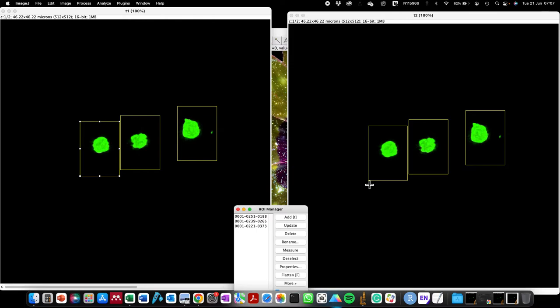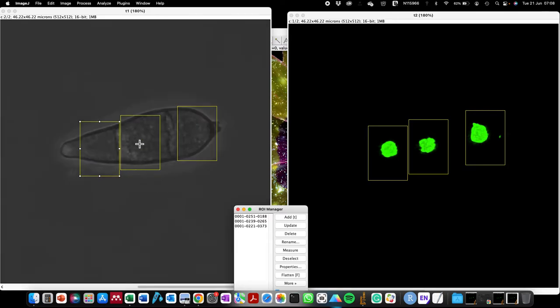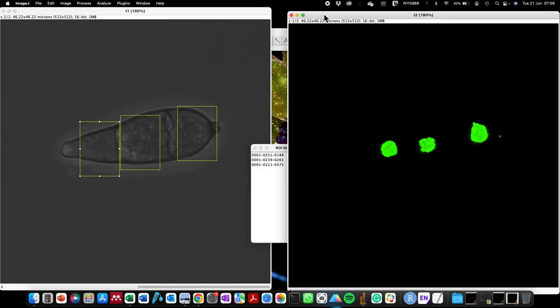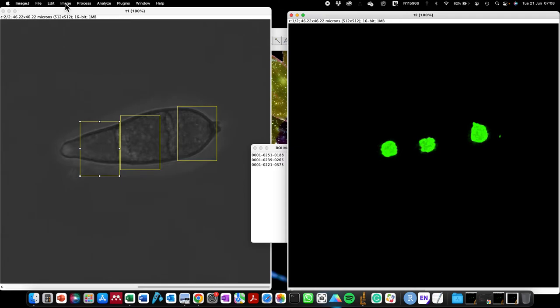I hope you found this tutorial useful. Another quick shortcut I'm going to show you with ImageJ, so that you keep your workflow very quick and simple: if I want to duplicate an image, instead of going to Image > Duplicate, you can see there is a symbol in front of Duplicate. ImageJ shows you the keyboard shortcut to perform the task. Because I'm using a MacBook, you can see the upward arrow, which is the symbol for Shift.